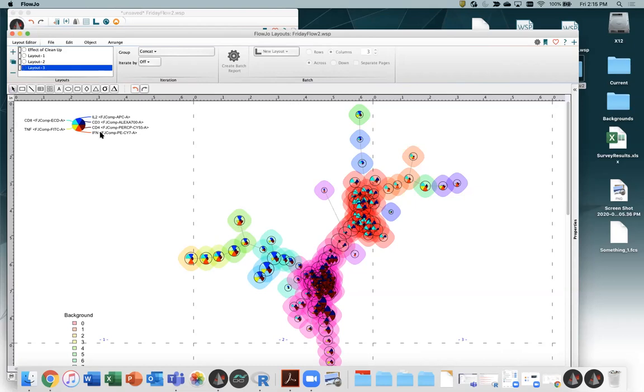So that's interferon gamma, IL-2 expressing, CD4 positive T cells with a little bit of TNF. So these are highly polyfunctional T cells here. And we can see that maybe here's the 8 version of that, with just more TNF in this population here. The pink ones here look like they have the brown and the blue wedge. So these are pretty extreme in those wedges and nothing else. These are just CD4 T cells that didn't have a lot of the cytokine activity happening, so probably coming from the unstimulated samples, which there were 3 of. Here's this red population here, which is light blue for CD8 positive.